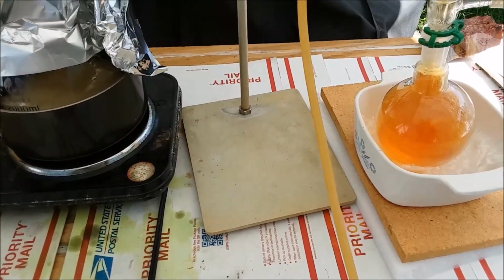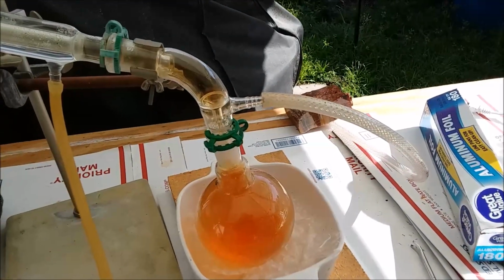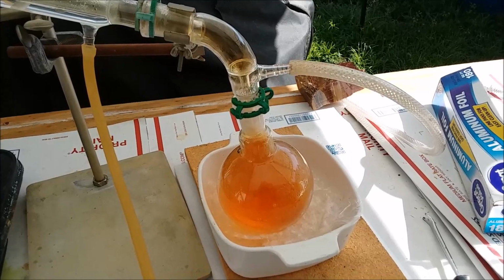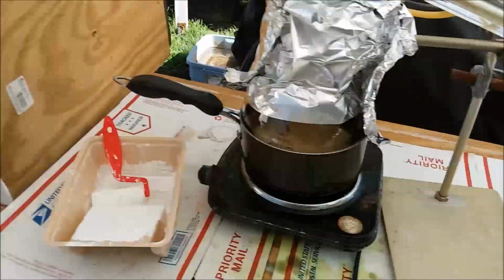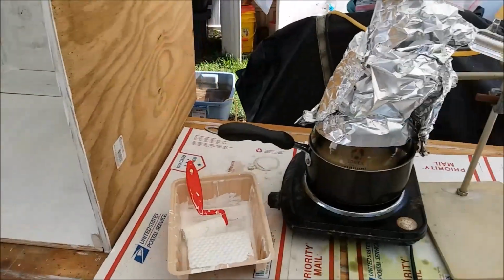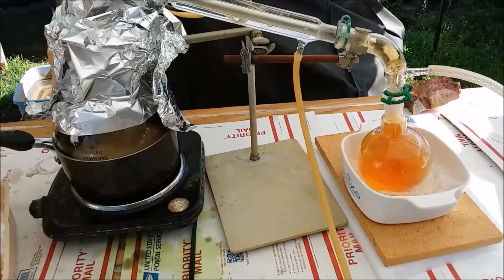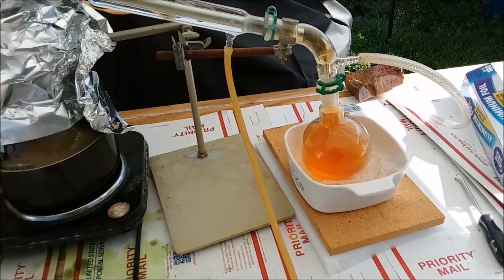Oh, and my sacrificial tubing is working great. I haven't hardly even got a whiff of nitrogen dioxide while I've been working over here painting the inside of my fume hood, which in the future I'll be able to do these stinky reactions in. So that's working pretty darn good.